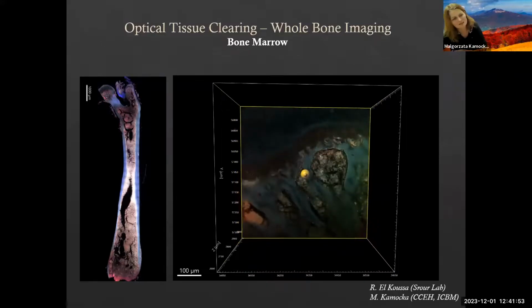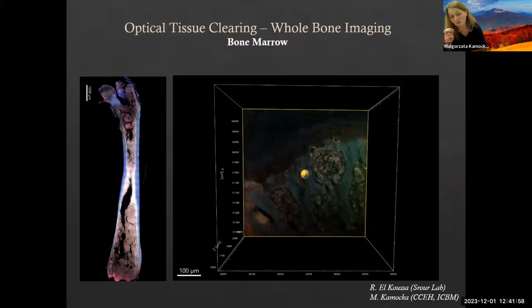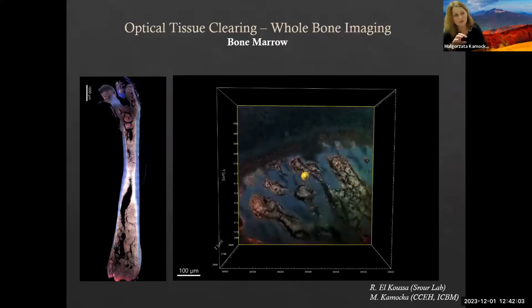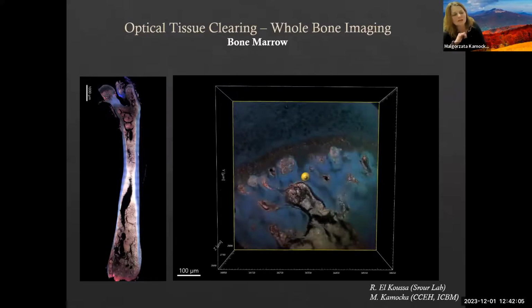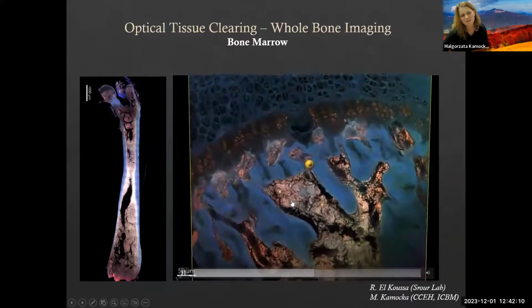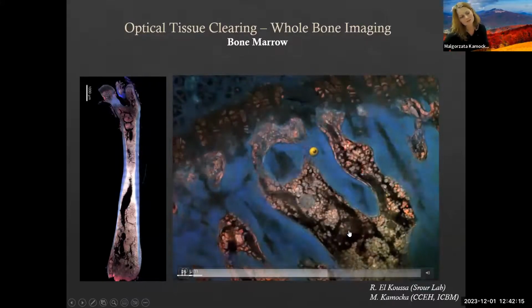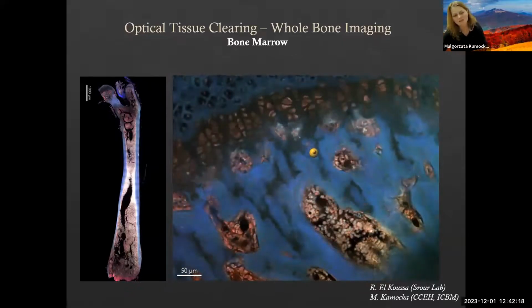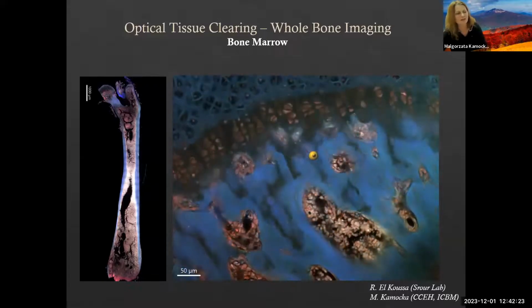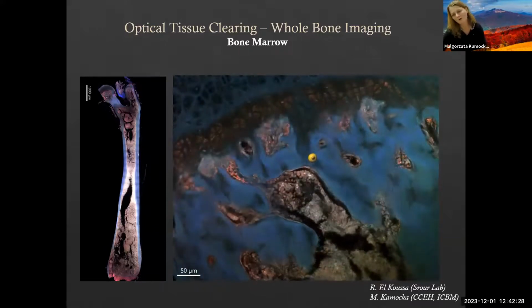In that projection, you can see an image of the bone, which we have based on second harmonic generation of collagen, which the two-photon microscope allows us to do. And we also have multi-channel imaging. We see components of the cell, we see megakaryocytes, and we see in yellow some osteomacs. So it is quite successful, but to be very honest, not as much as we would like, because due to high autofluorescence, we didn't achieve the results which we were hoping for.